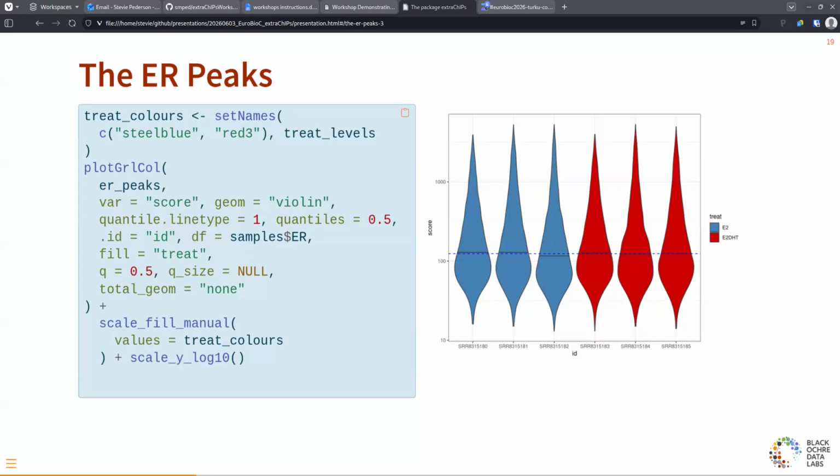Really big question: on average, how many peaks do you expect? How long's a piece of string? It depends on each particular ChIP target. In the H3K sample, I think they've got about 40,000, and they're much wider. It's just how many sites the target binds to. If it's a really prolific binder, you'll get thousands. If it's a really niche targeted binding protein, it could vary.